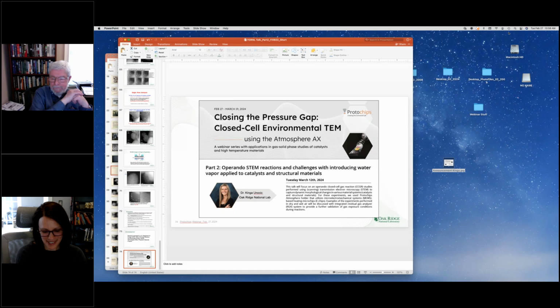That sounds like a good focus, though. I hope that you get to explore a little bit of that in the near future. So you've experienced E-TEM with heating holders and now closed cell high pressure types of systems. Is there a time you would choose an E-TEM over a closed cell, or is closed cell, in your opinion, the way to go, particularly for catalyst research with how important the pressure can be related to the results? What are your thoughts on that?